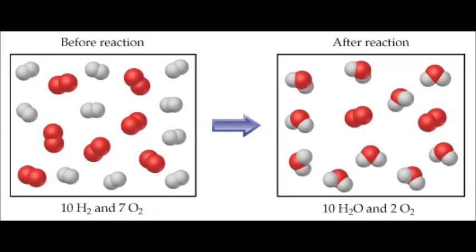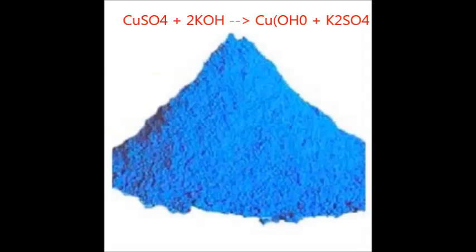With the data that was collected, we concluded that the differences in height were due to the limiting reactant exceeding the ratio that the empirical formula called for. Because the empirical formula for potassium hydroxide to copper sulfate was 2:1, the ratios of 1:1 and above reached the maximum height of the precipitate that could be formed. The change from potassium hydroxide being the limiting reactant to copper sulfate being the limiting reactant contributed to the significant change in height for the precipitates.